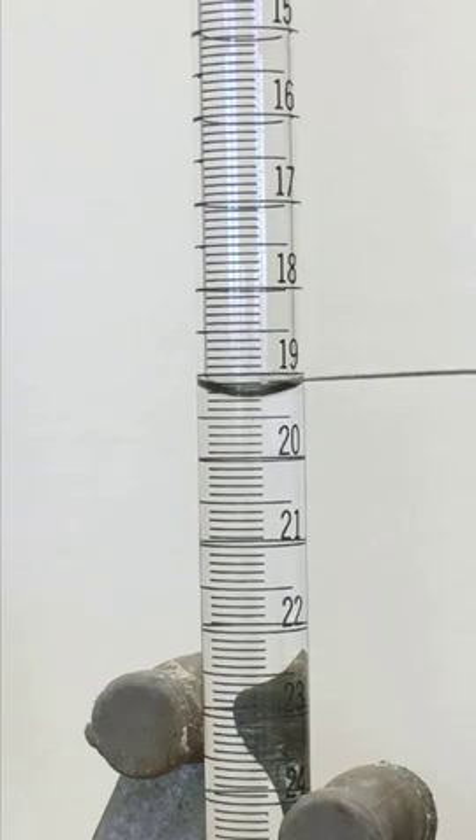And then these go by tenths. So this is 19.1, 19.2, 19.3. And so it's between 19.2 and 19.3, so our first three numbers are 19.2. And then there's space in between the 0.2 and the 0.3, and you can estimate where you think that is. And it looks like to me 19.28 milliliters.